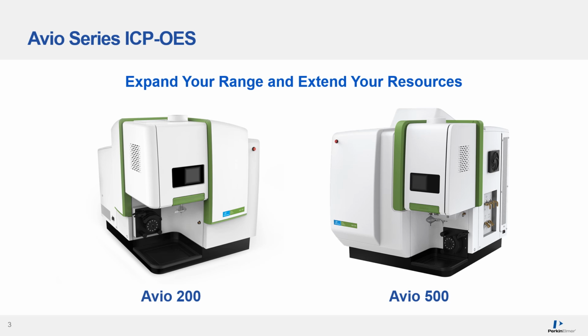PerkinElmer offers two models of ICP-OES. The Avio 200, which is on the left-hand side of this screen, is a sequential unit, whereas the Avio 500 is a true simultaneous ICP-OES and is equipped with two dedicated detectors. We're going to focus on the Avio 500 in this talk.